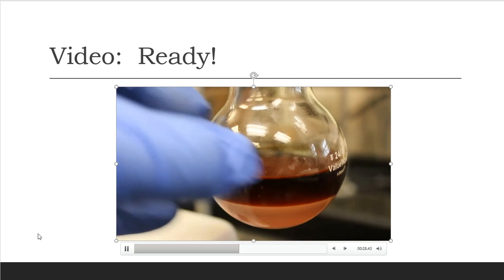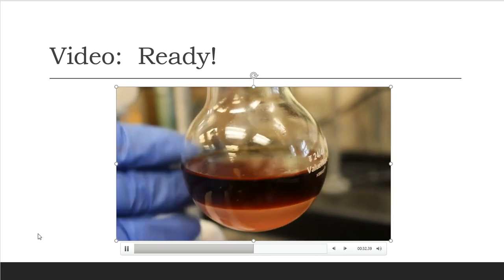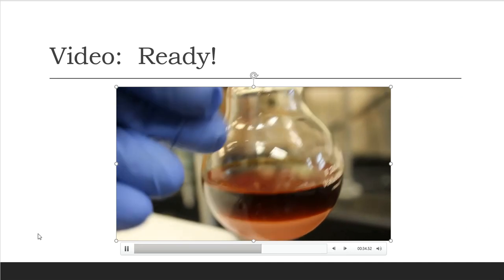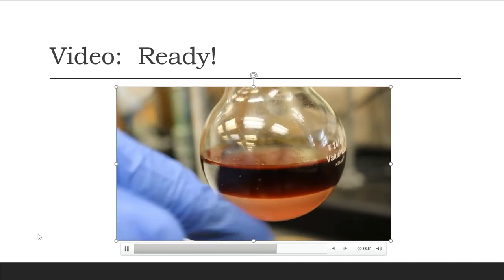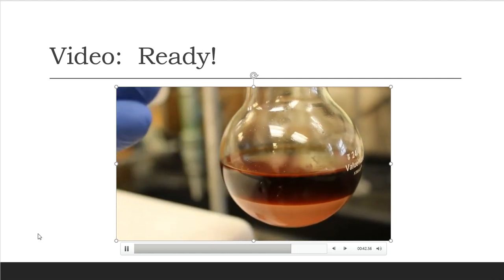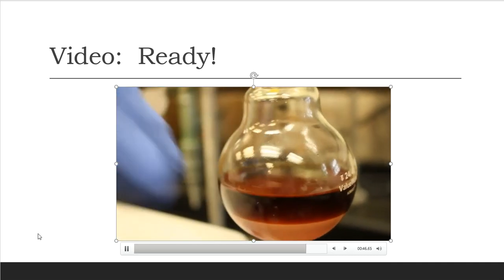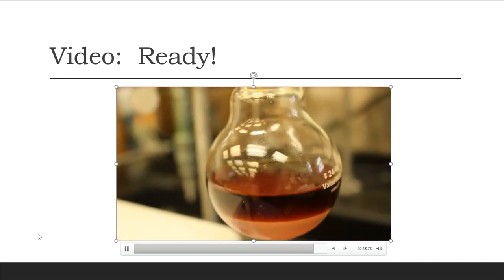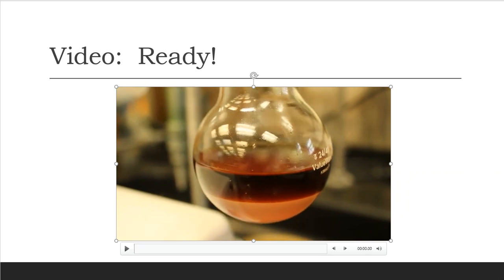So I'm getting ready to take this and add it to a separatory funnel. The directions tell me to take some hexanes and add it for transfer. There still might be a little bit of remnant left over in this boiling flask, and if so, that's okay. The hexanes will grab onto any of that and transfer it over to the separatory funnel for me. So that's what I'm getting ready to do, so stay tuned.